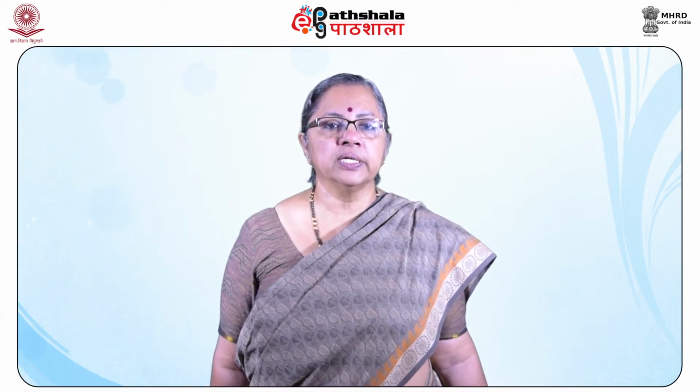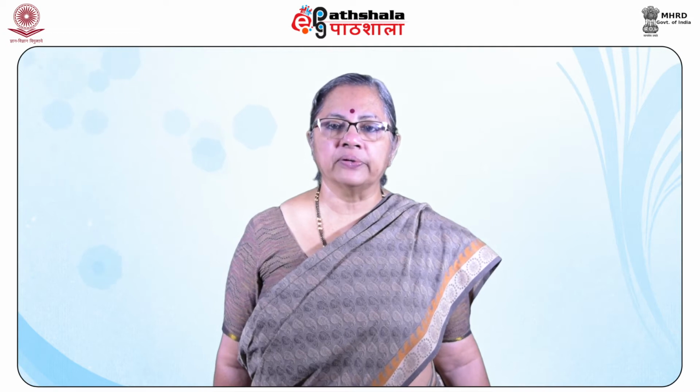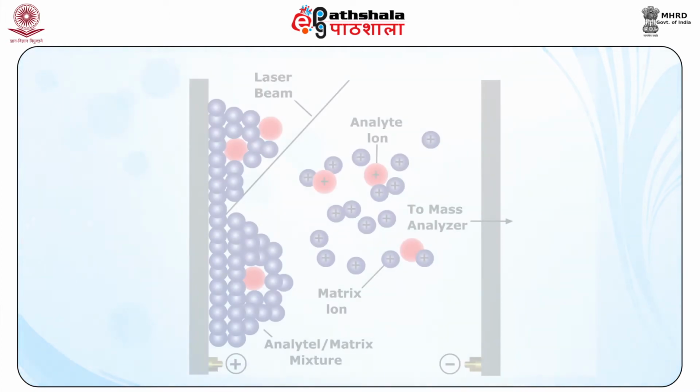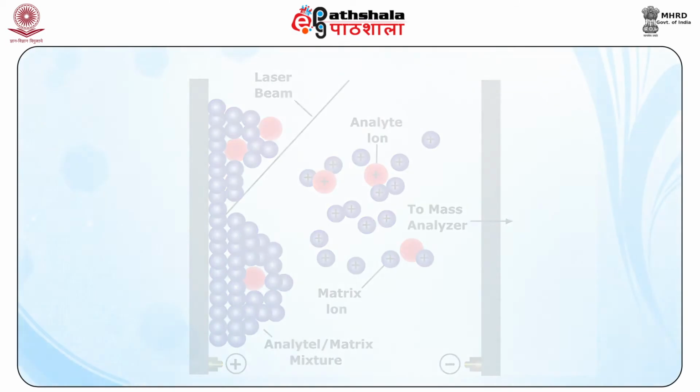The crystalline material is then irradiated with a short nanosecond pulse of laser light of a wavelength absorbed by gentisic acid. The high energy attained by the gentisic acid or matrix causes the peptide to be ejected into the gaseous phase with a charge varying from plus 1 to plus 3. These ions are then analyzed by the mass spectrometer.